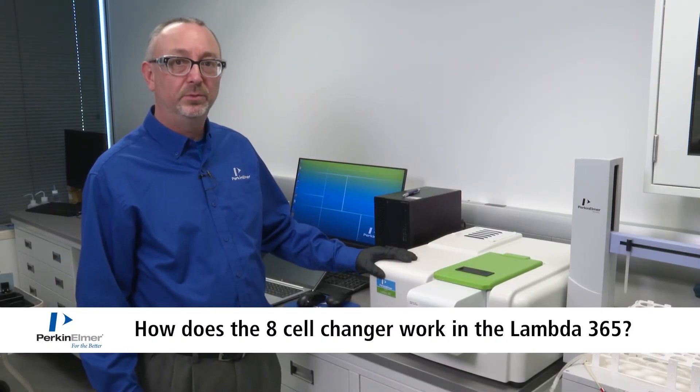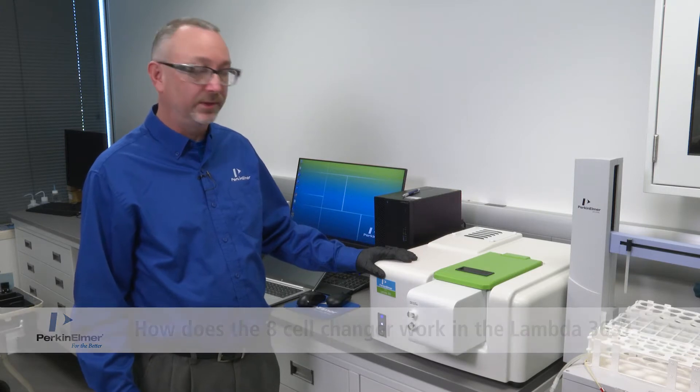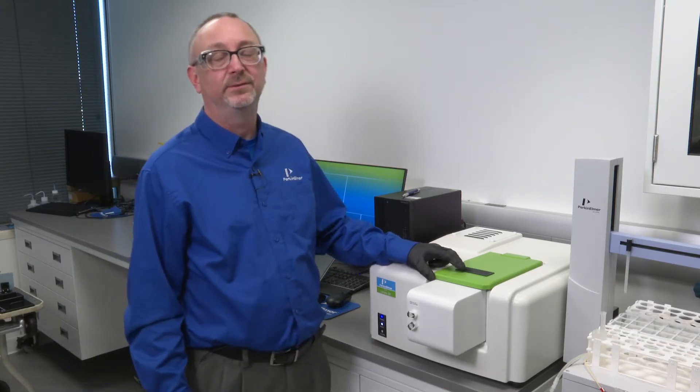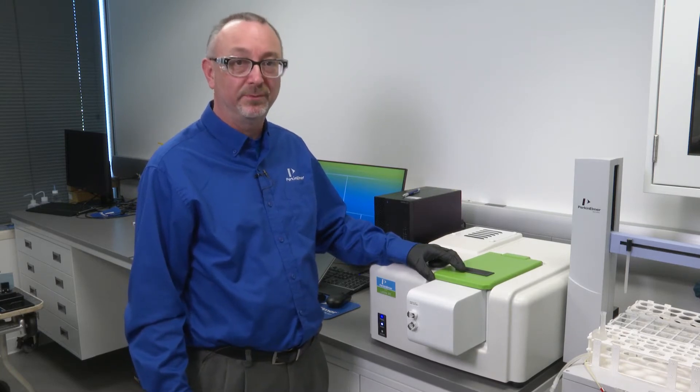Lambda 365 is our platform UV-Vis instrument. The sample compartment is modular, meaning that we can install a variety of accessories to allow for the successful and efficient measurement of materials.